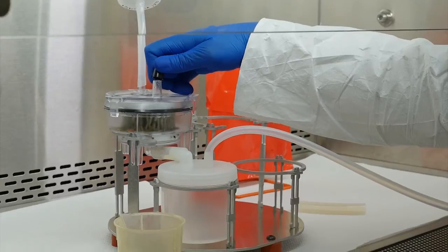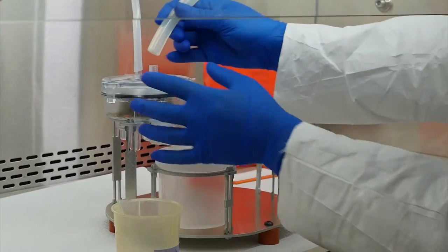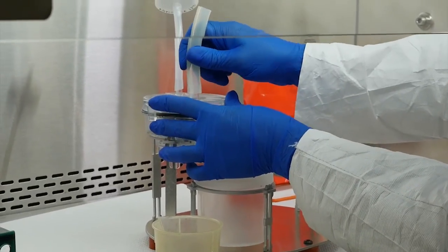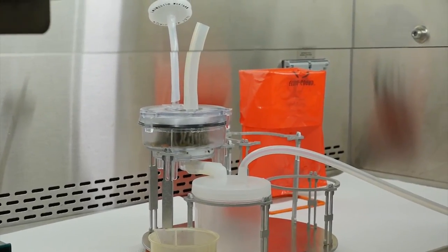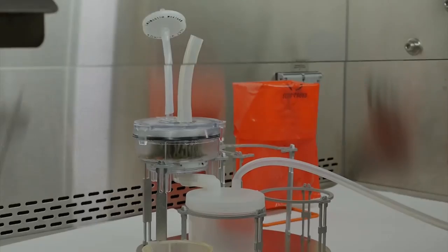Remove the black cap from the top filter inlet and attach the short, wide diameter tubing. Your setup should look like this, and you are now ready to elute your sample.